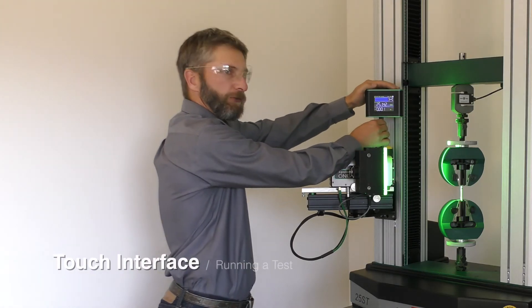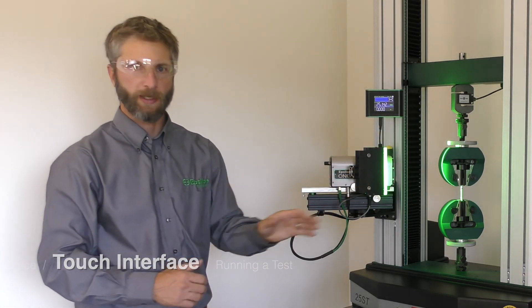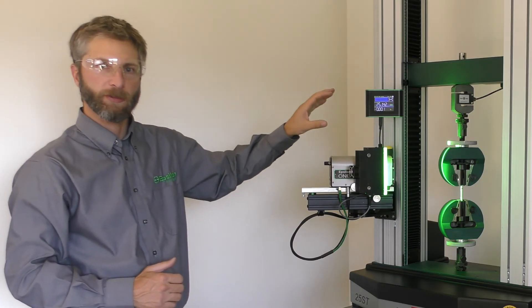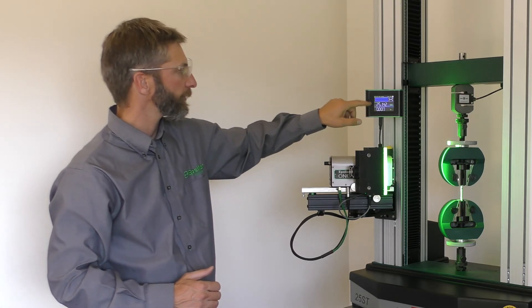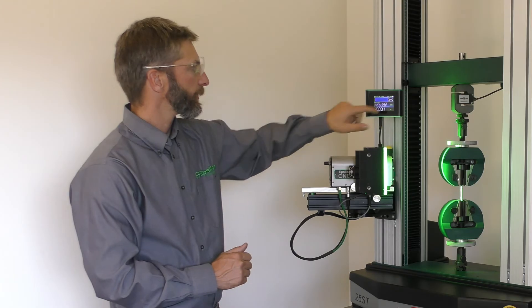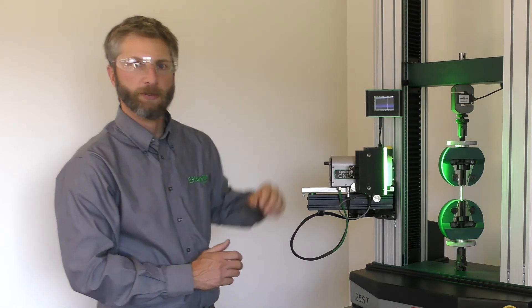Using the optional touch interface, the Epsilon-1 can be operated without any software at all, just like any mechanical extensometer. The touch interface provides a complete interfacing and control package — from display of parameters such as length, gauge length, and strain, to beginning a new test, or configuring any of the available parameters for the system.